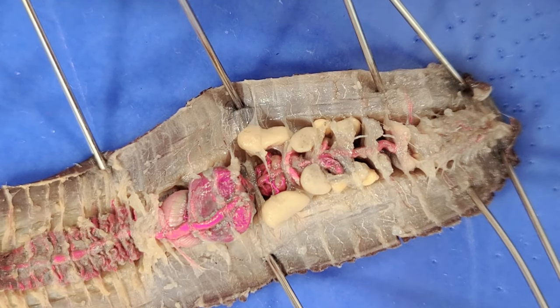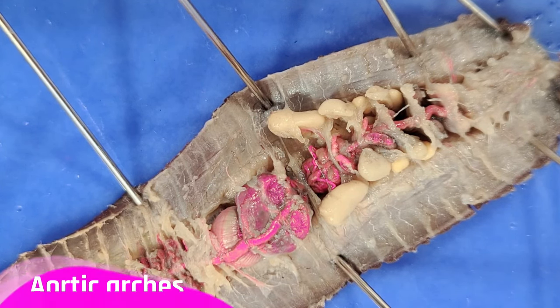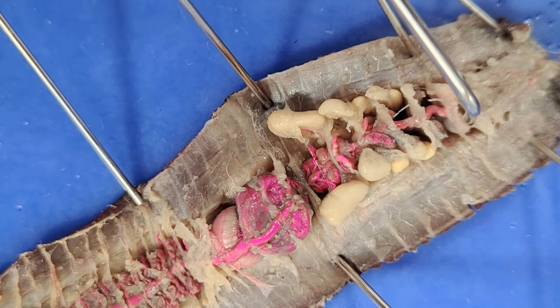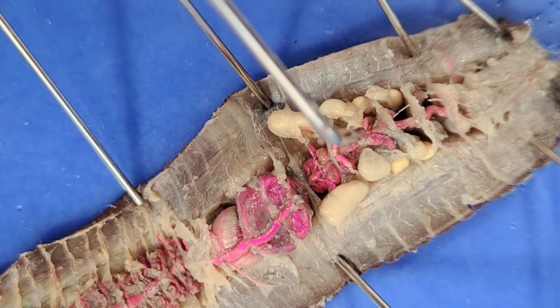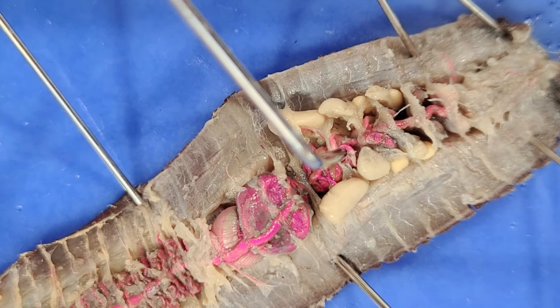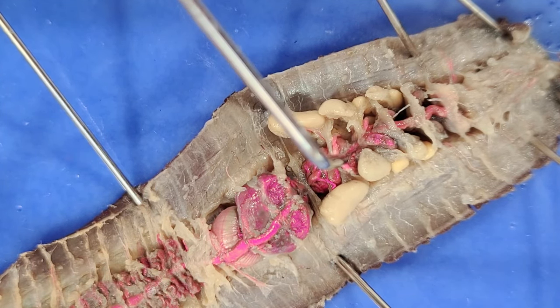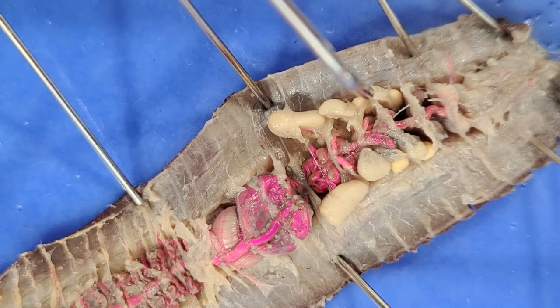So now let's move all of these reproductive organs aside. Now you can see the worm's hearts. Earthworms have five hearts, which are each in an arch shape. These five hearts are called aortic arches — you can see them right here: one, two, three, four, and five. These aortic arches are basically modified versions of regular blood vessels that pump blood throughout the worm's body. They're also pink because the circulatory system of this worm has been injected with red latex.